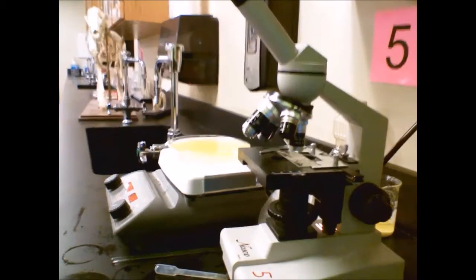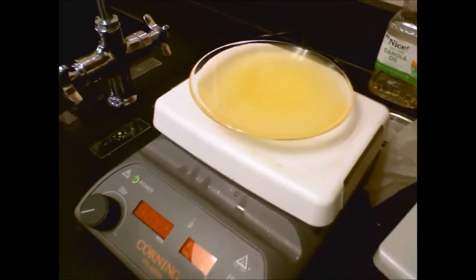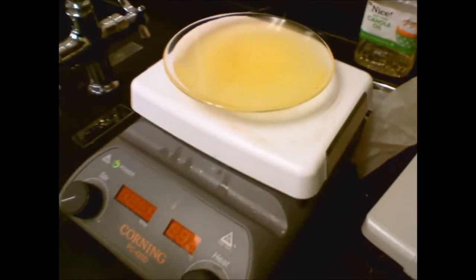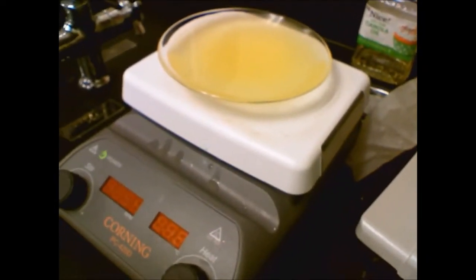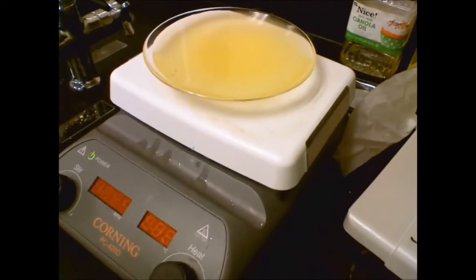We have crystals. So I'm going to pop you off your stand, sweep you on over here, and if this thing will focus, por favor. Well, you can kind of see we have ditsy dots. Lovely little ditsy dots. So these are very tiny little orthorhombic sulfur crystals. Now these are actually much smaller than the crystals I had last time because I just turned this off. I didn't try and bring this down slowly, and since oil doesn't really evaporate too well, the only way that we end up with the sulfur coming out of the supersaturated solution is through the temperature change, not through evaporation.